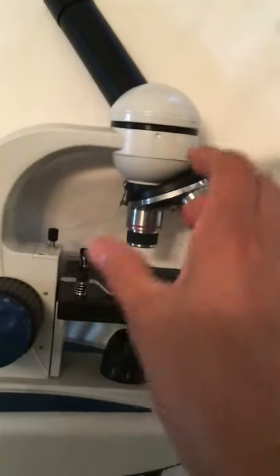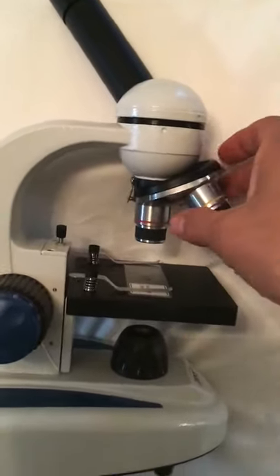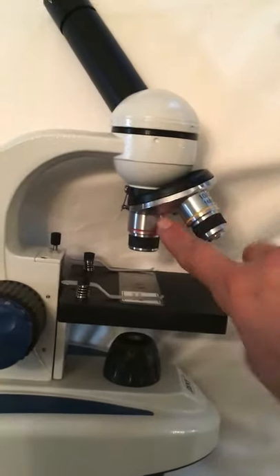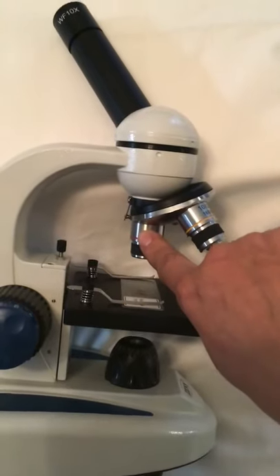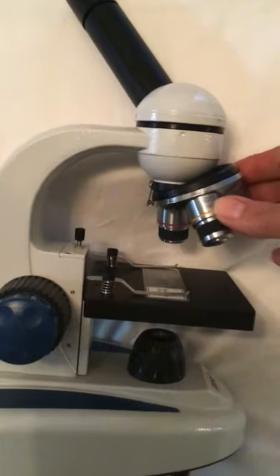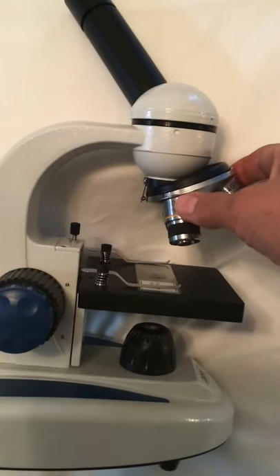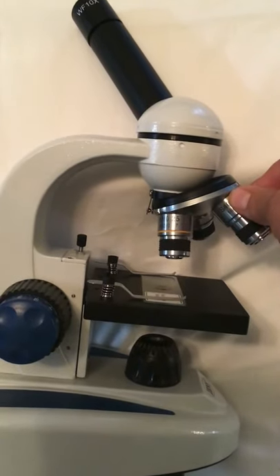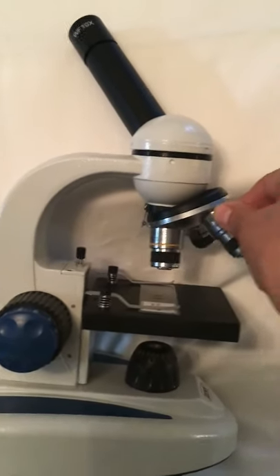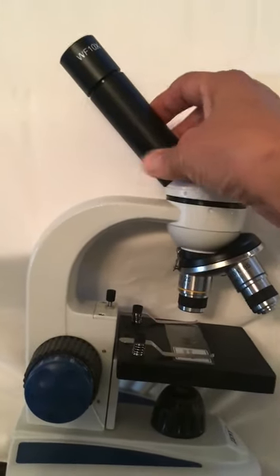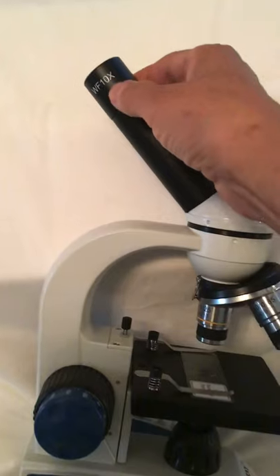The lenses that are used for magnifying the object are called objectives. You have the scanning objective, and this is at 4x power. Then you have the low objective, which is 10x power. And then you have the high objective, which is going to be at 40x power. So how do you figure out how big the object is when you're looking at it? Automatically, your eyepiece is going to increase the size of the image by 10 times.